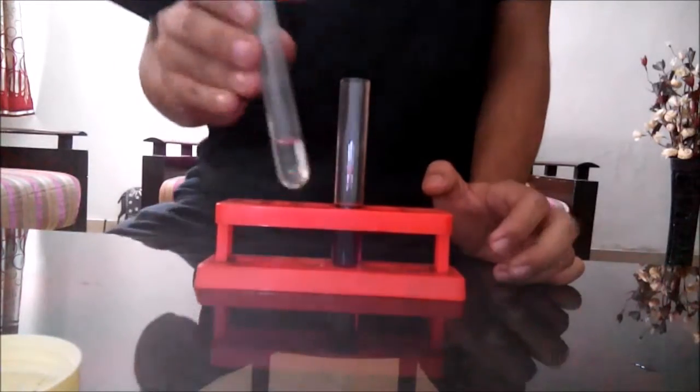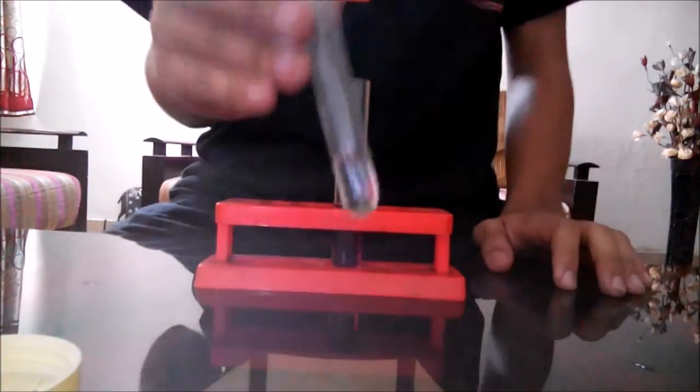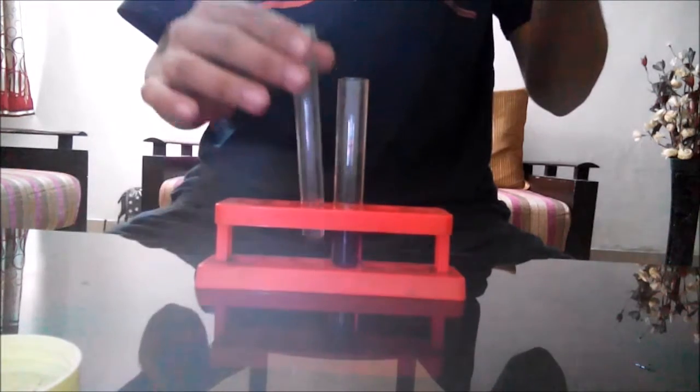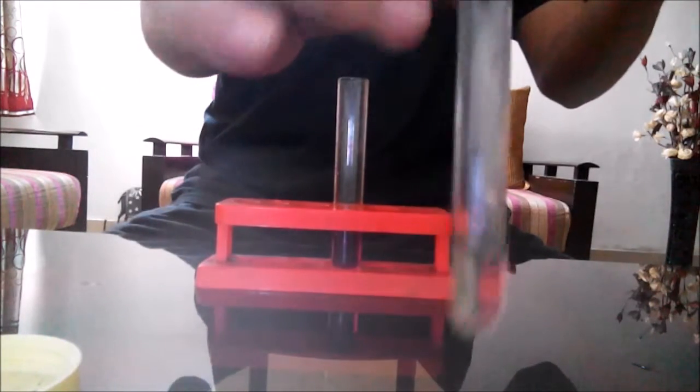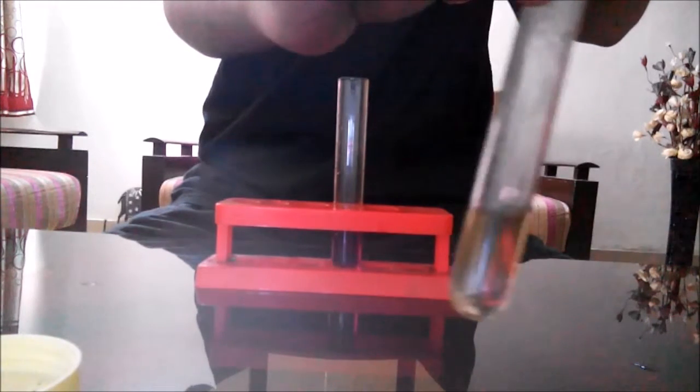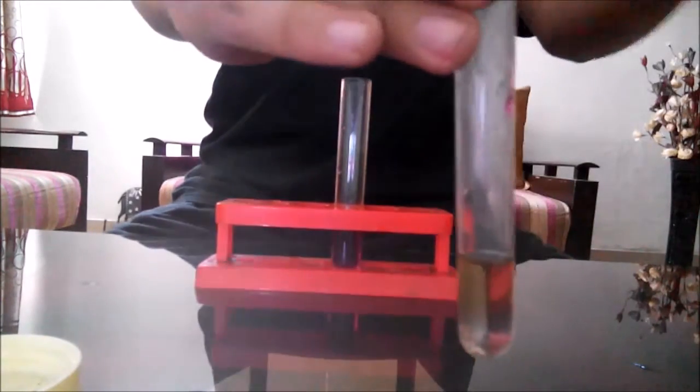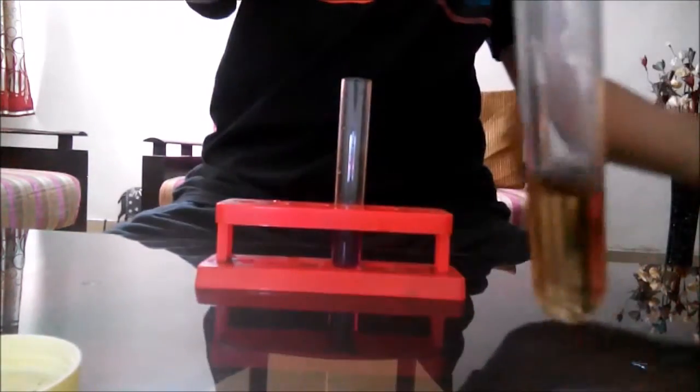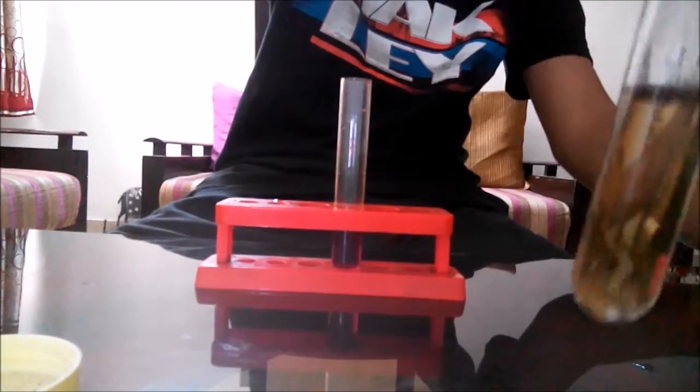Now for the fourth reaction I have hydrochloric acid in this test tube, a strong acid. Just observe the test tube. You will see that the color of the potassium permanganate has disappeared. Once more I am adding—again it has disappeared. This yellow color is probably due to chlorine gas that is being produced in this reaction.